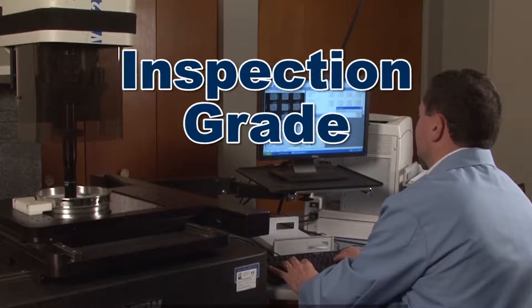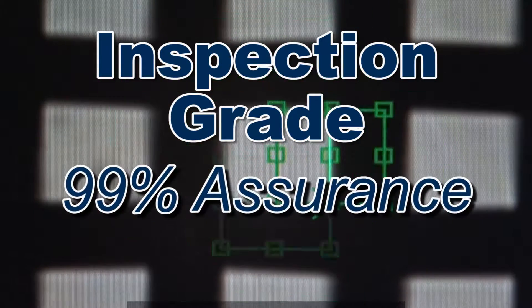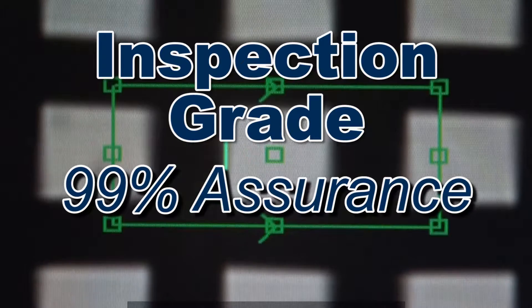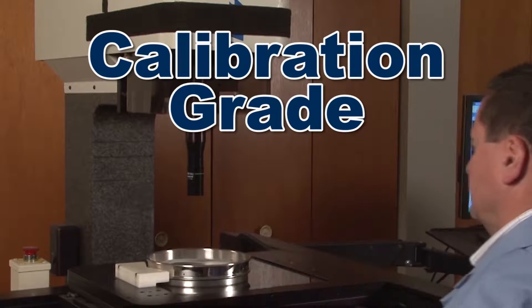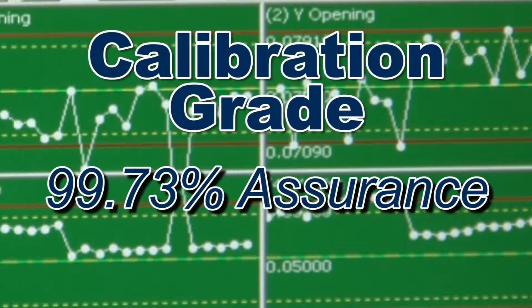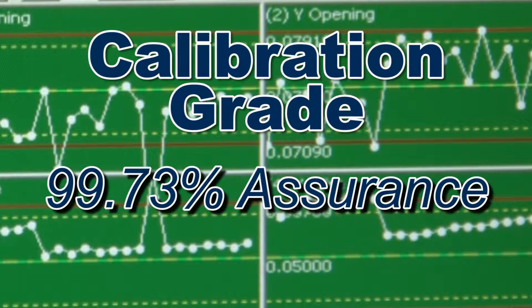Inspection grade test sieves have a specific number of measured openings with a 99.73% assurance that your test sieves are within ASTM or ISO standards. Calibration test sieves have two to three times more measured openings with the same 99.73% assurance that your test sieves are within ASTM or ISO standards.